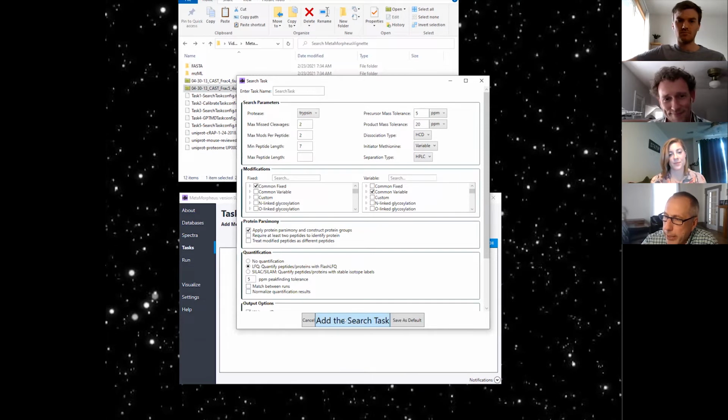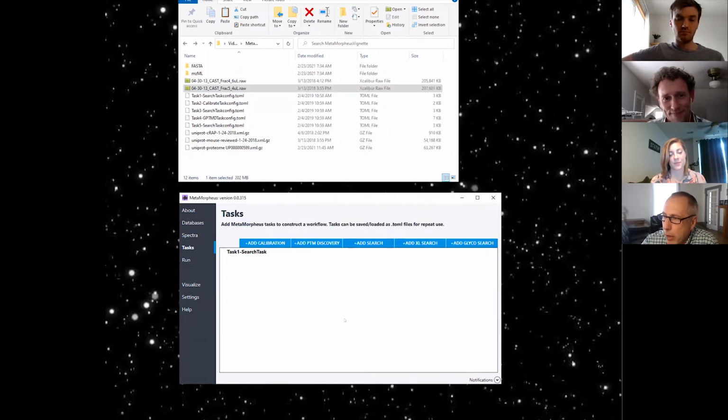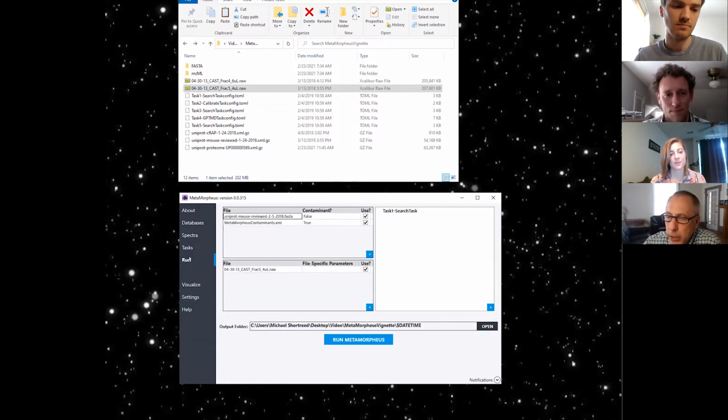I'm just going to add the task, and that's all you need to do. You don't really have to play around with it too much unless you have some sort of more unusual data set. Rachel's going to go through those parameters when she talks about the next round of search. All right, so here we are finally at the run task.